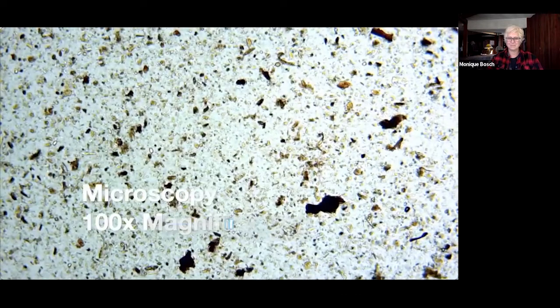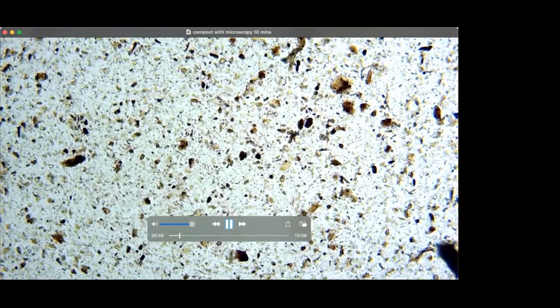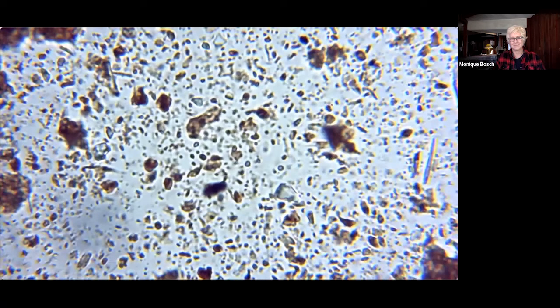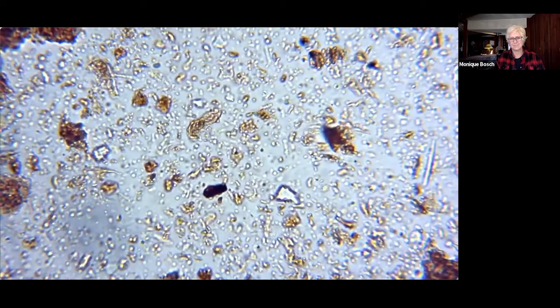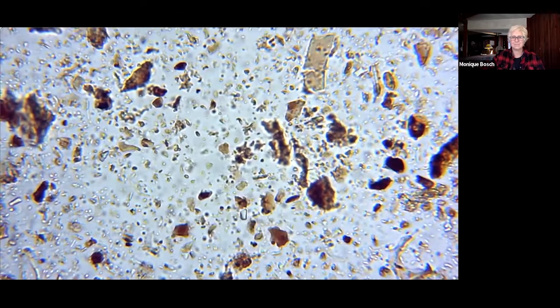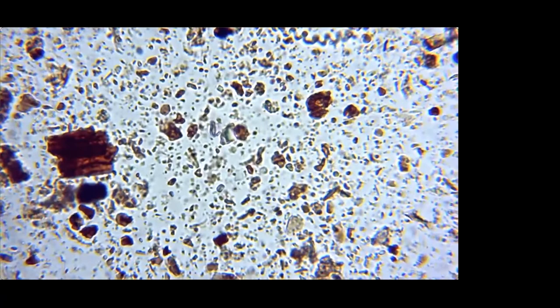This is compost from Earth Care Farms. You can see it's very full, but what I am seeing is not the fungal. Loads of bacteria, very diverse. Aggregates throughout, so nice, mature. No predators that I could find, but active and alive. So it is definitely bacterial dominant. A nice assortment of various types of bacteria.